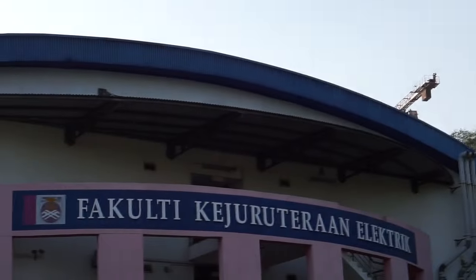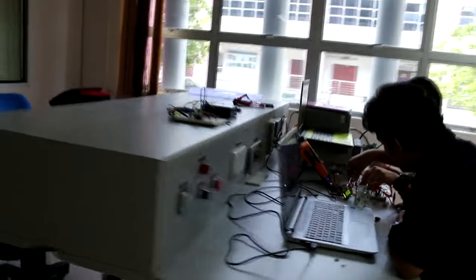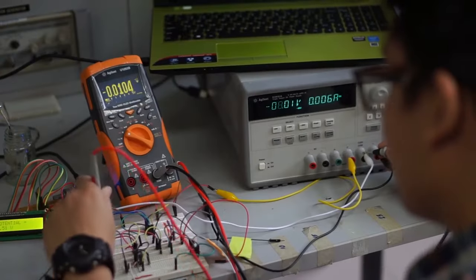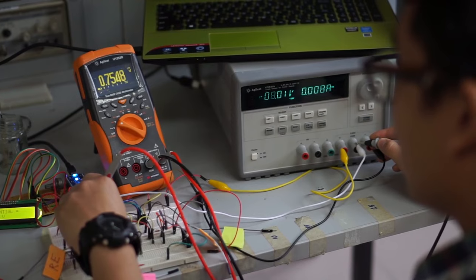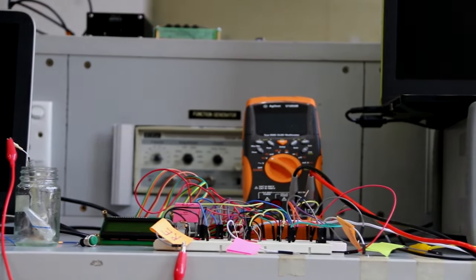The undergraduate students of group MY120 from different disciplines of science are working together in this regard. They propose an interfacing circuit to existing electronic measurement instrumentation to allow DNA mutation detection using nanobiosensors.